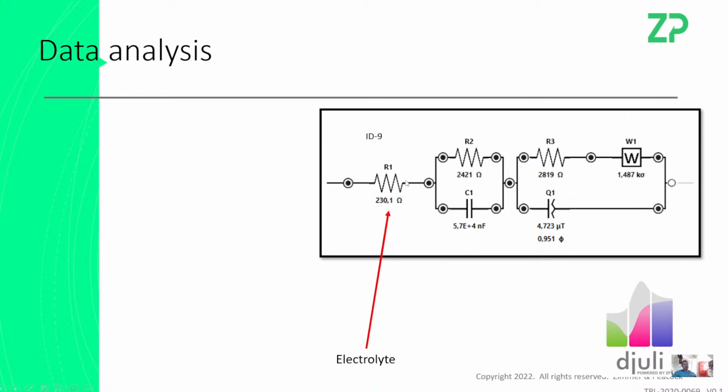This is the electrolyte essentially, the solution. This is the linker, so the capacitor and resistor due to the linker, and this is the antigen. So you could have a couple of things. You could be getting an increasing R3, but a decrease in R2. And it's essentially hiding your signal, because if one increases, the other one decreases. If you use what's called a Randles circuit, they're both summed together in your particular circuit. So you might just actually be using the wrong equivalent circuit.